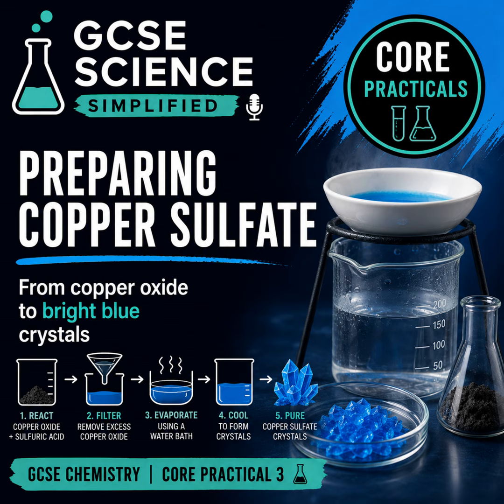So, now we're on to step 5, evaporation. You evaporate some of the water, not all of it, because we want to concentrate the solution. Which now leaves us to step 6. This bit's the easy bit, cooling and crystallization. You leave it, and this is where the magic happens. Blue copper sulfate crystals form.